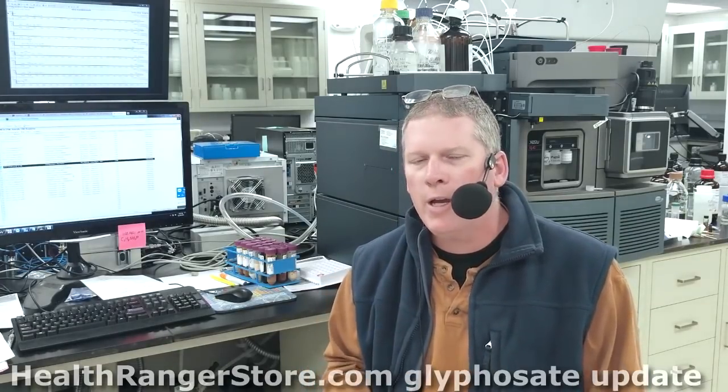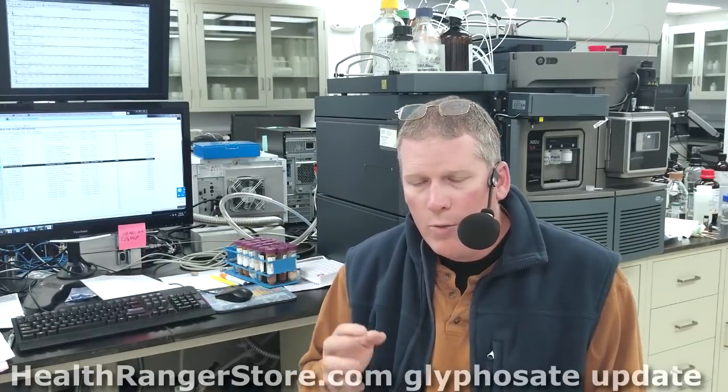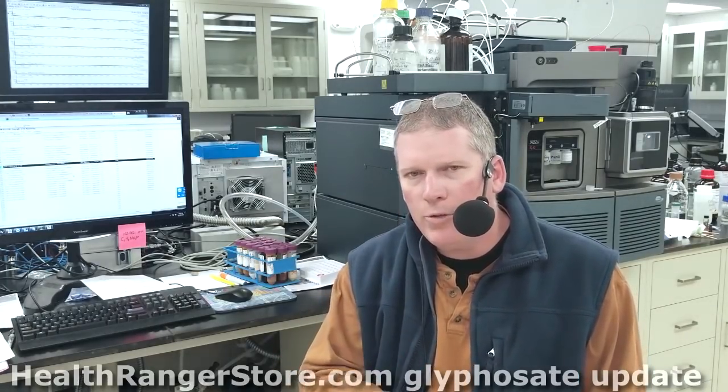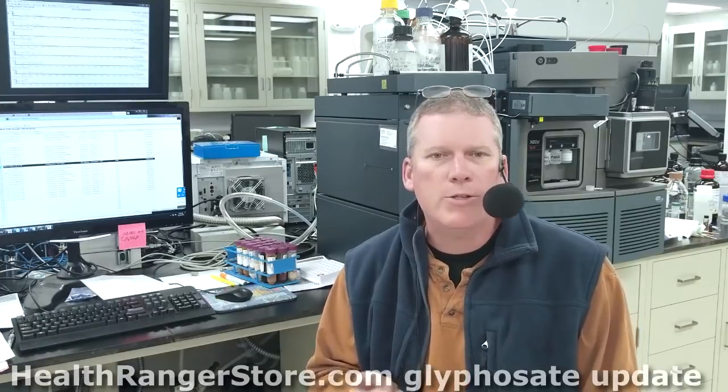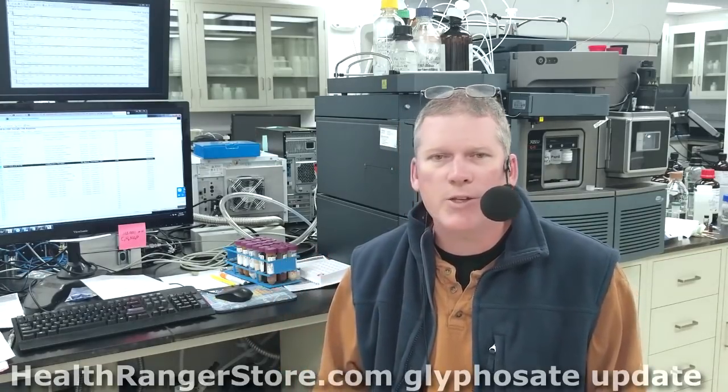And you might wonder, well, what can we detect? How low can the detection go on this instrument? We've already proven in-house, through an in-house method validation system where you try to get to what's called an LOD and an LOQ. LOD is your limit of detection. LOQ is your limit of quantitation. You need to know both numbers if you're going to do real science with a triple quad mass spec instrument. We know that our LOD for this instrument with glyphosate is below 1 part per billion.